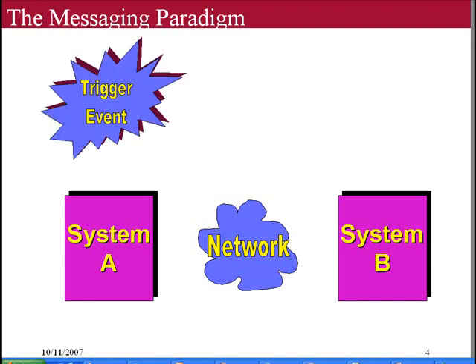So in the messaging paradigm, the idea is that there's something that happens in the real world. A patient visits a hospital or is found with a sign or symptom. They register them in a system so that the system is now aware of the patient or this encounter, and an order is placed in the system for a diagnostic test or other kind of thing, and that causes information to flow from an ordering or clinical information system to, say, a pharmacy system or a laboratory system.